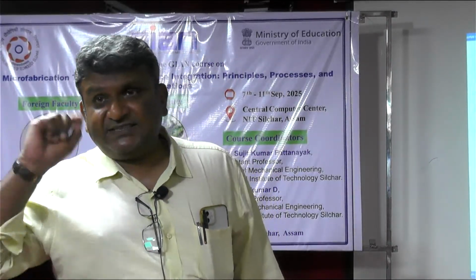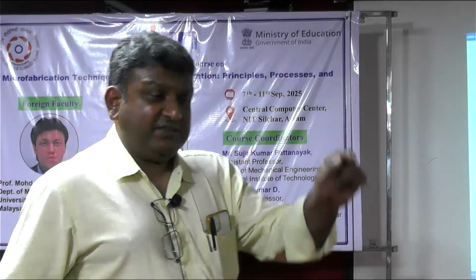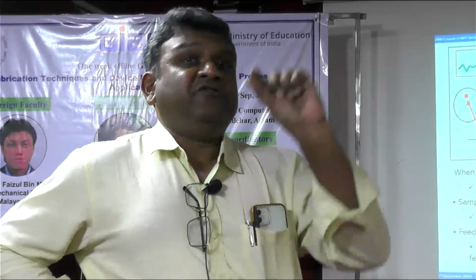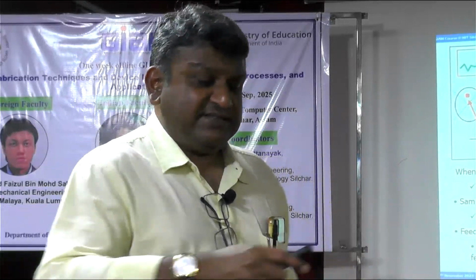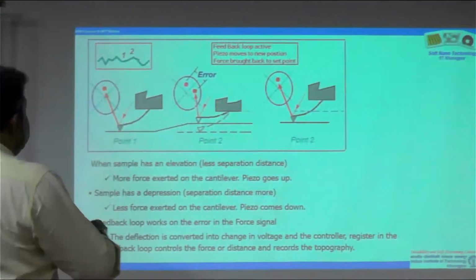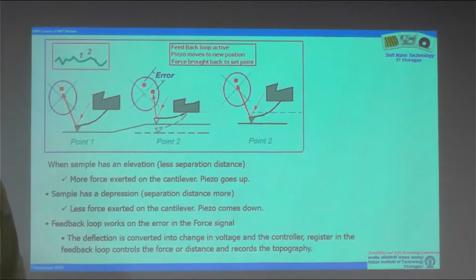The answer is yes, it satisfies your purpose, because the moment light is falling somewhere else, you are actually generating a deviation in voltage. Because where is this? This is not at a random place or a mirror, this is on the surface of a quadrant photodiode. So every time light falls somewhere else, it can read the voltage, and since it's a quadrant photodiode, it can also give the values of ordinate and abscissa. So you now get a deviation or an error.